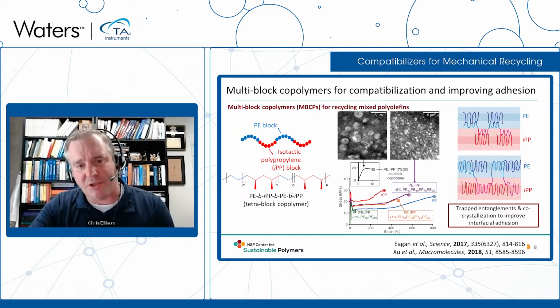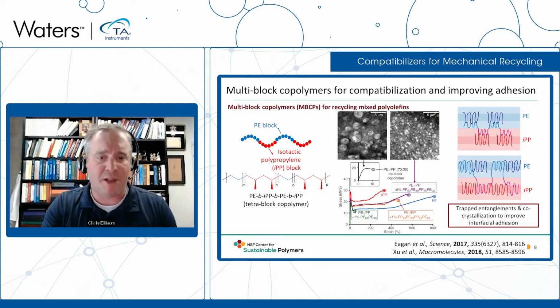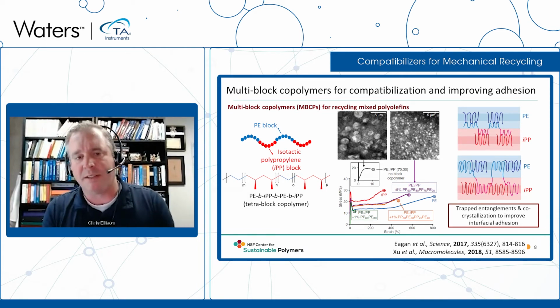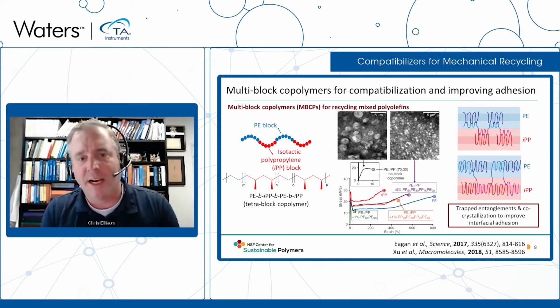This shows in this stress strain tensile test that the blends of isotactic polypropylene and polyethylene with 1% of the additive produce mechanical properties that are in between the two pure components. And so this is a signature of compatibilization. It's a signature that you produce a tough blend, given the strains at break are in excess of 400%. You can compare and contrast this to simpler molecules. You might argue this diblock copolymer in green is a simpler molecule, but at 1 weight percent, it's not effective. I didn't point this out, but I'll just note that the blends that don't contain any compatibilizer are shown in the middle panel here as an inset. And those materials fail with a strain at break of something like 10%.